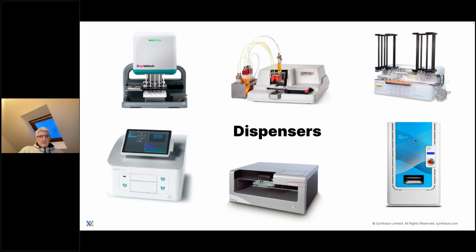As with any automation system, each of these has its own strengths and weaknesses, which can be used depending on the type of DOE that you're running, but also on the kind of biology that you're doing and what volume you can run that biology at. These aren't really direct like-for-like competitors. Really, they all have their own strengths and weaknesses, depending on what your application is.